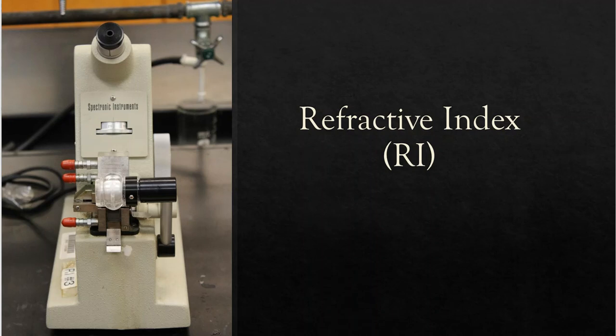So this is an RI. We abbreviate it RI, of course, for refractive index. And it looks like I'm using RI number 3. So this is the instrument that I am using to make my measurements with. Sometimes that's very important. Sometimes I have to note that on a data sheet or in a laboratory notebook if I'm writing one up.